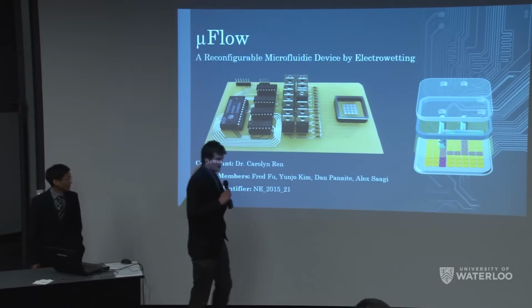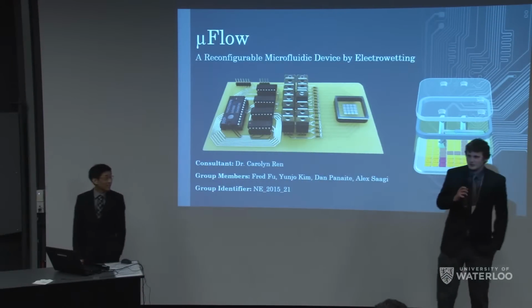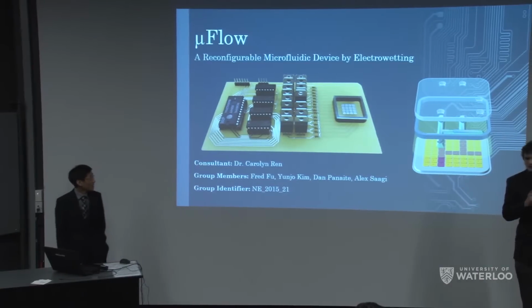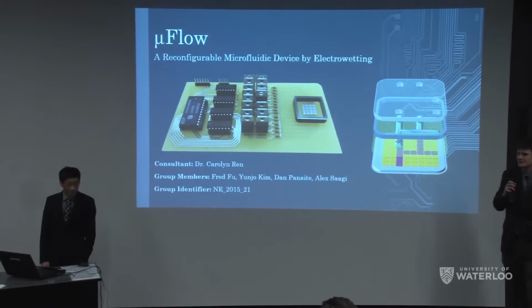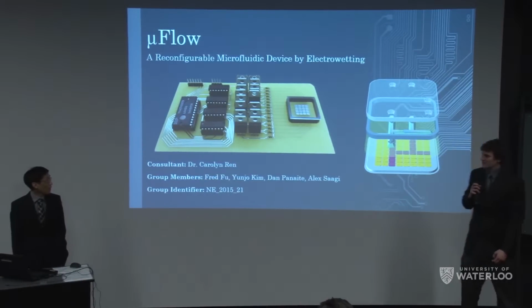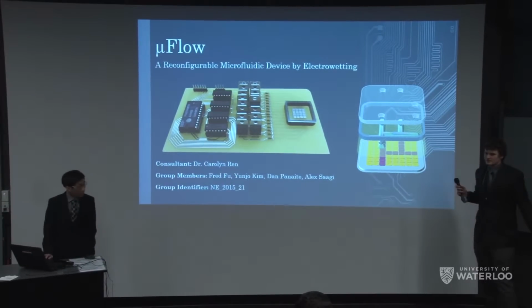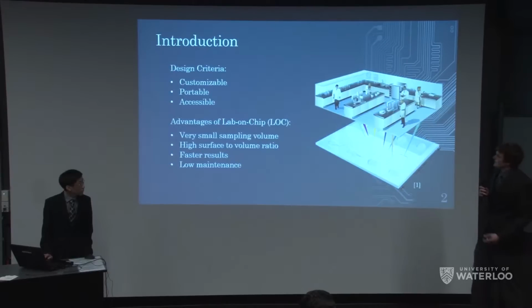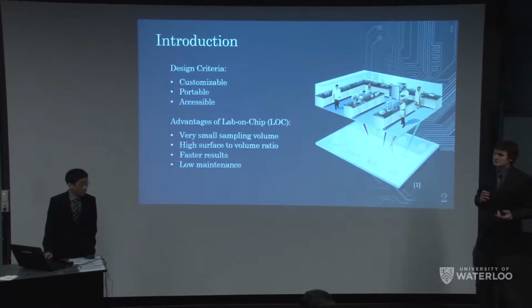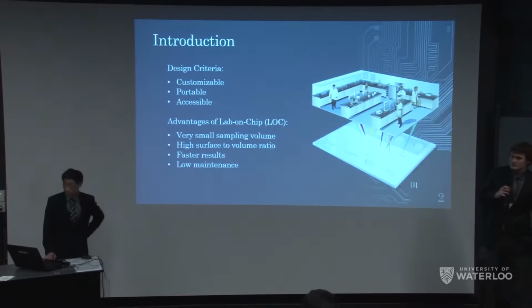So, good afternoon. For our fourth year design project, Yunjo and I are going to be talking to you about our reconfigurable microfluidic device, which is operating based on the principles of electrowetting. Before we jump right into the design, microfluidics is a broad topic. In our group, we decided to hone in on lab on a chip for two main reasons: small sampling volume and high surface to volume ratio.